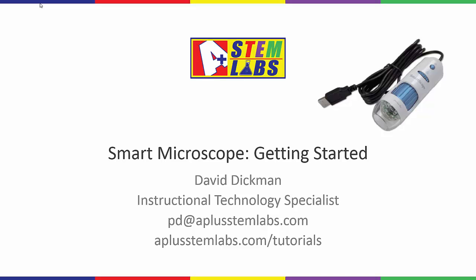This video will show you how to get started using your smart microscope, also known as a handheld microscope.